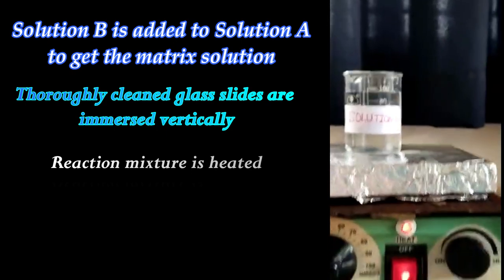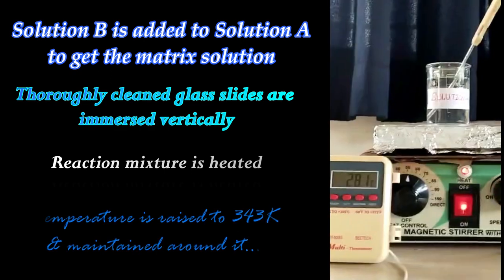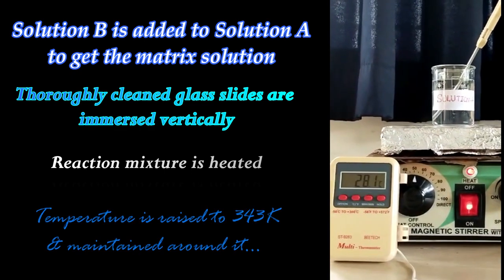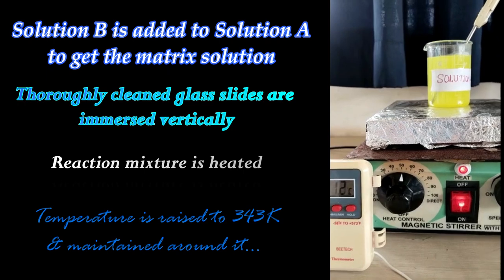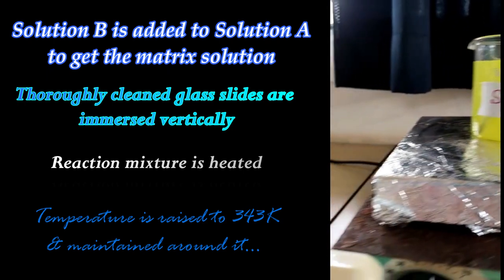Here it is a magnetic stirrer where only heating is done and we are not using the stirrer. For the deposition of the thin film, the ideal temperature was found to be almost around 70 degrees Celsius, so we need to wait till then.